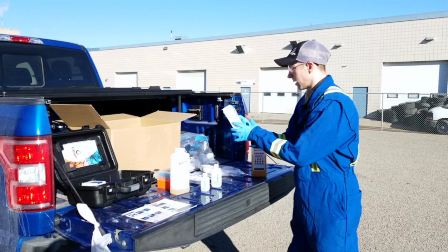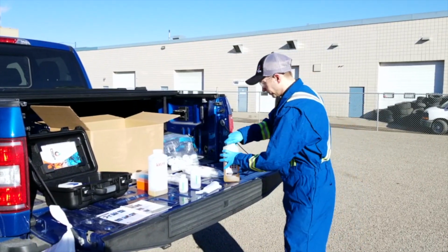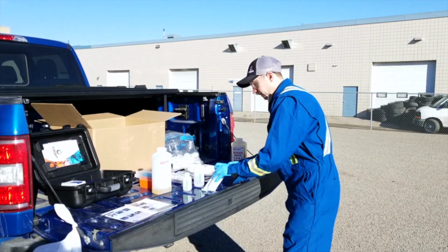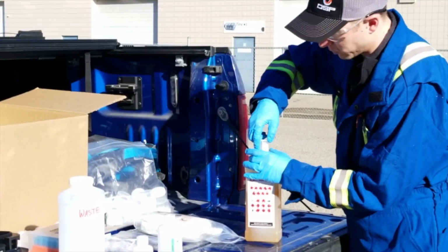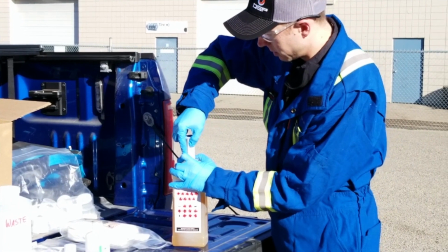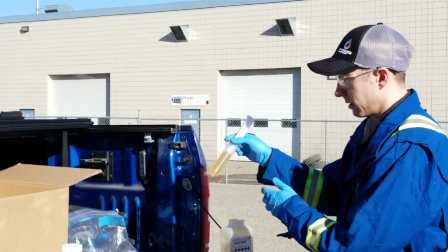So first step, we're going to grab our syringe, mix up our sample. We're going to draw up 50 milliliters into this 60 ml syringe. I always draw a little bit up and push it back in so that I get rid of any air in the syringe. And then we want to draw up 50 mils, like that.